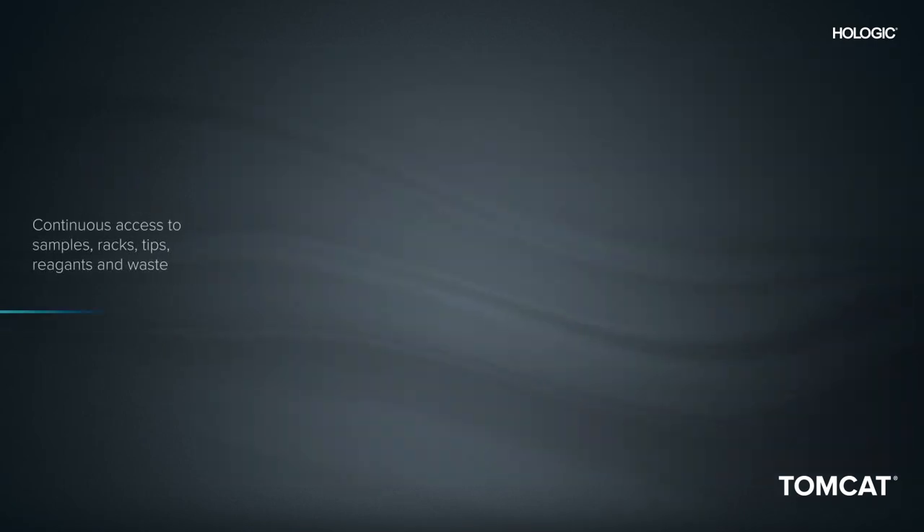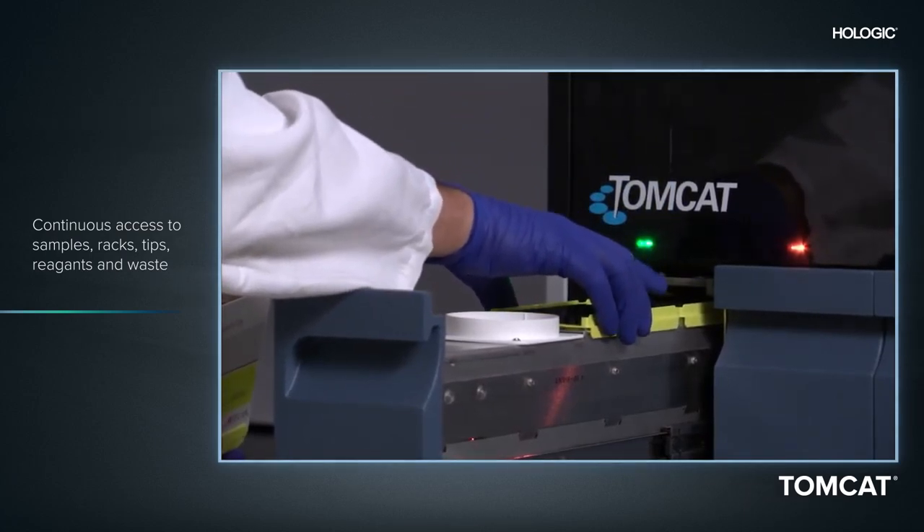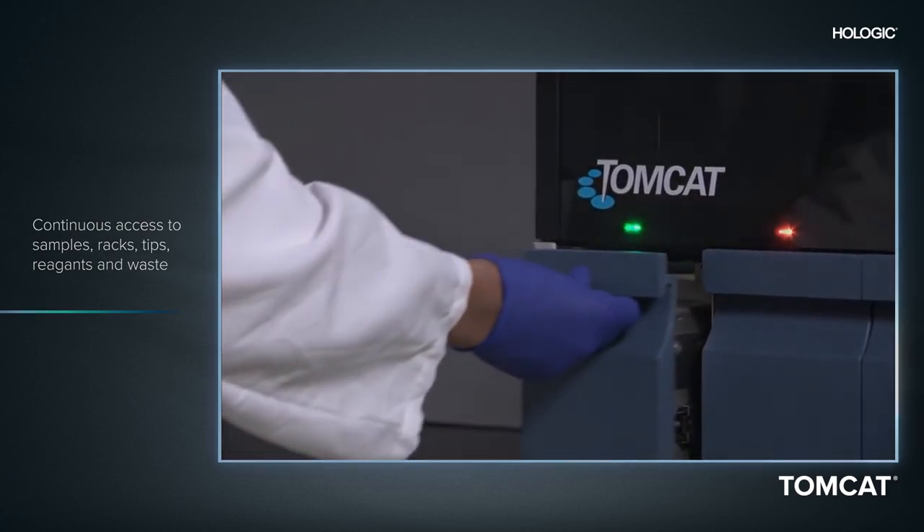With the Tomcat instrument's continuous access capabilities, operators may return at any time to add more samples, remove output racks, or manage tips, reagents, and waste.